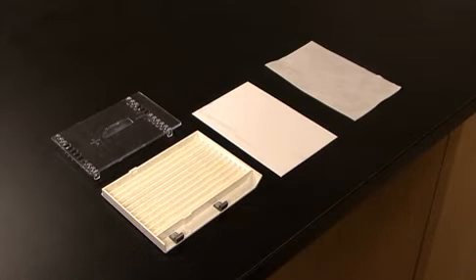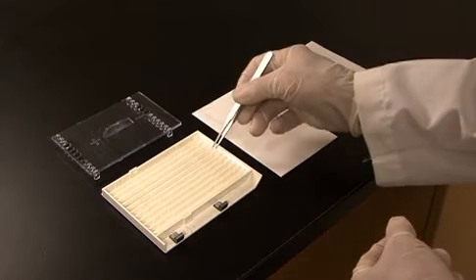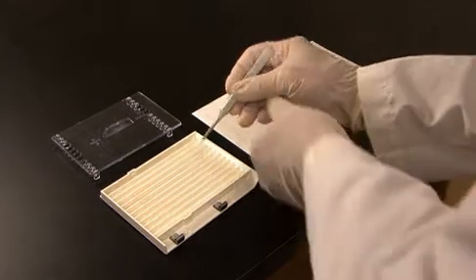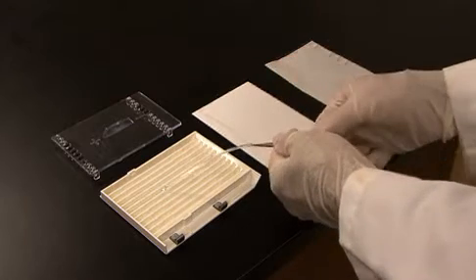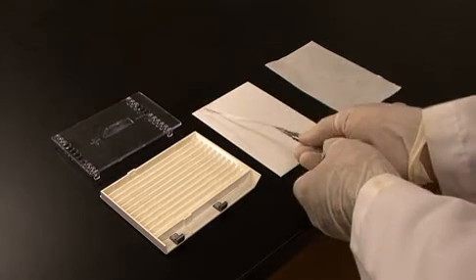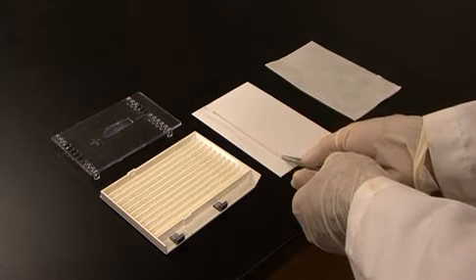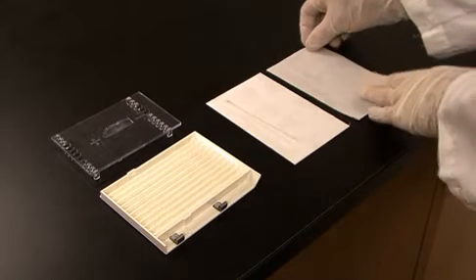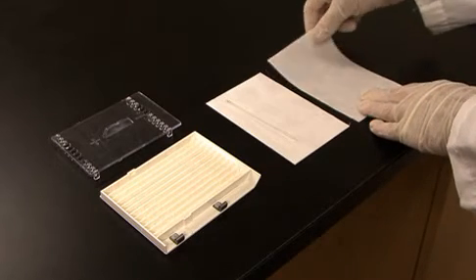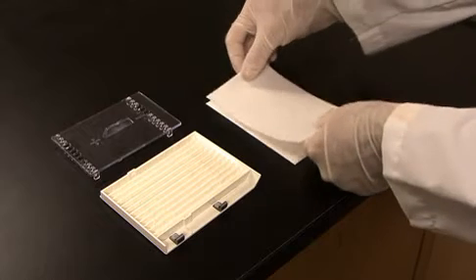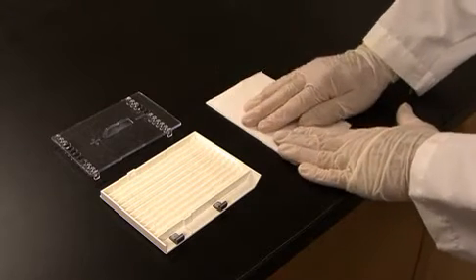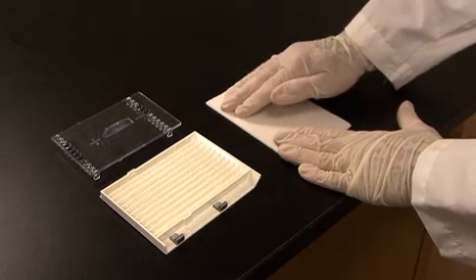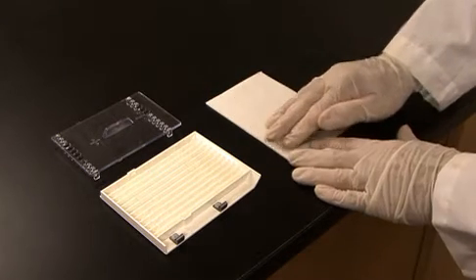Prior to equilibration, I will remove the IPG strip from the focusing tray and blot the excess oil off of the strip. First, pick up one end of the IPG strip, turn it over so the gel side is up, and place the IPG strip gel side up on a dry piece of filter paper. Wet another piece of filter paper and place the wet filter paper onto the IPG strip and gently blot the excess mineral oil off the strip. Be careful not to press too hard to damage the IPG strip gel.